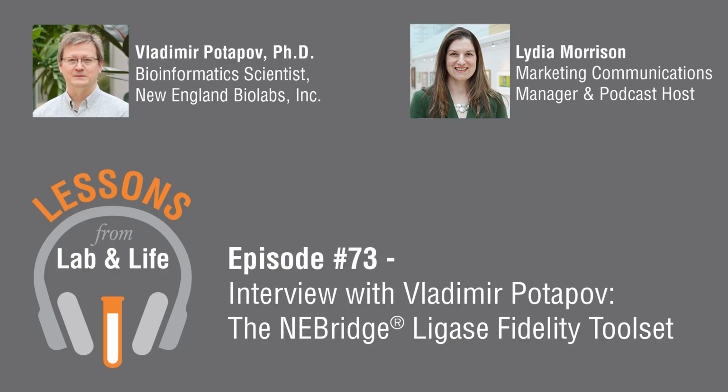So really a wide variety of tools, ranging from helping make calculations to helping design primers to full experimental design. The goal is to simplify the work of other users, either to analyze their data or to design their experiments. Some of those tools we use internally in our research, and when it's relevant to people outside, we also provide the tools for customers.